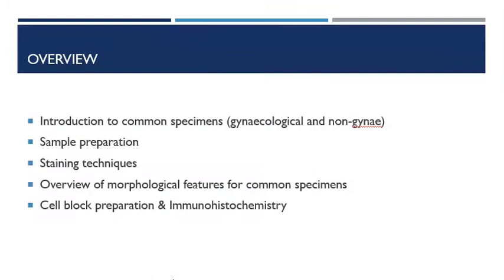So a quick overview of what I'm going to talk about. We'll be looking at what sort of specimens are used for both gynae and non-gynecological cytology, looking at the sample prep, the staining techniques. We'll be looking at some morphology features of some common cell types, and looking at cell block preparation, and also always comparing what cytology means in the context of what could be done, which is histopathology.